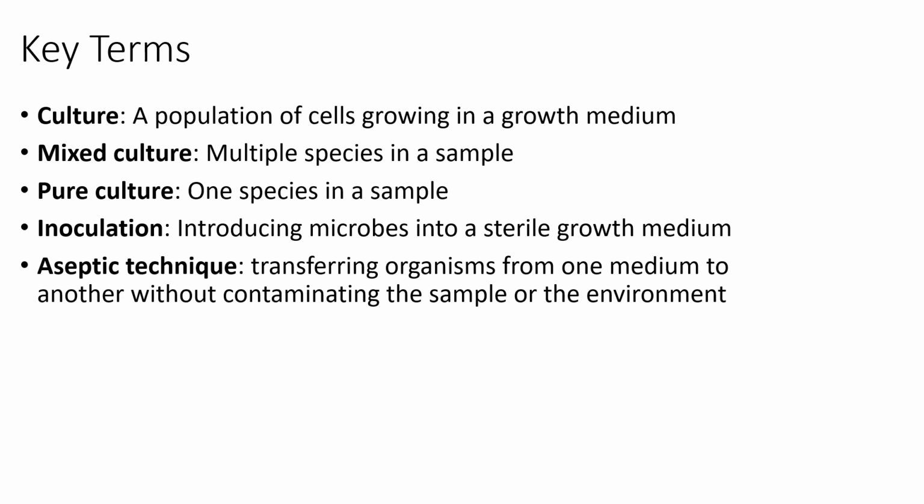Well, actually that might be in the streak plate. So sometimes we give you a mixed culture because then you can see the different organisms growing and that they grow differently on agar plates. But it kind of depends on the semester and the instructor. But if you have more than one species growing in a test tube or on a plate, you have a mixed culture.